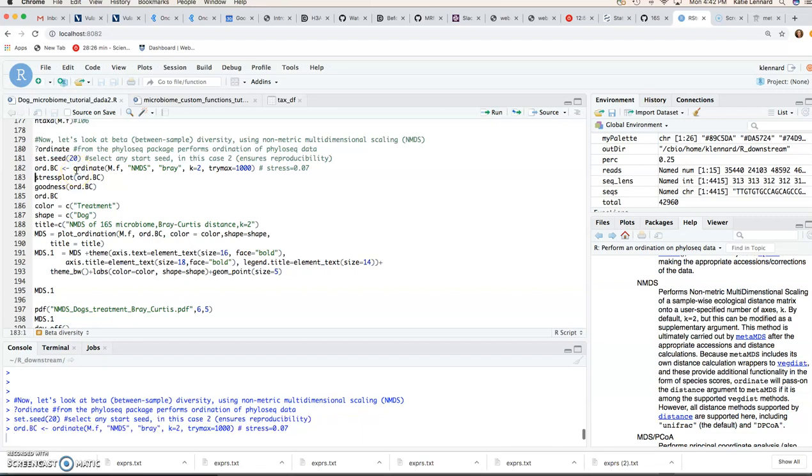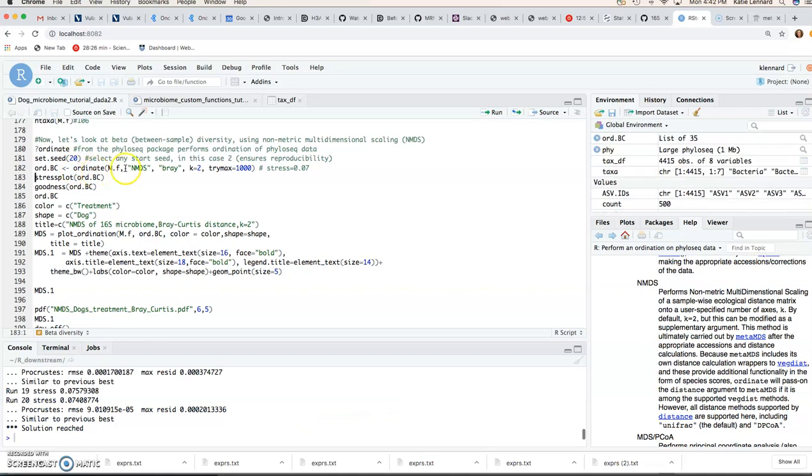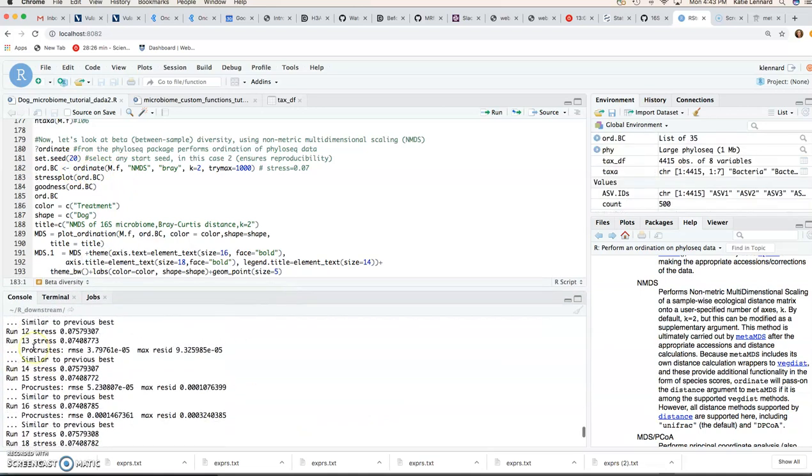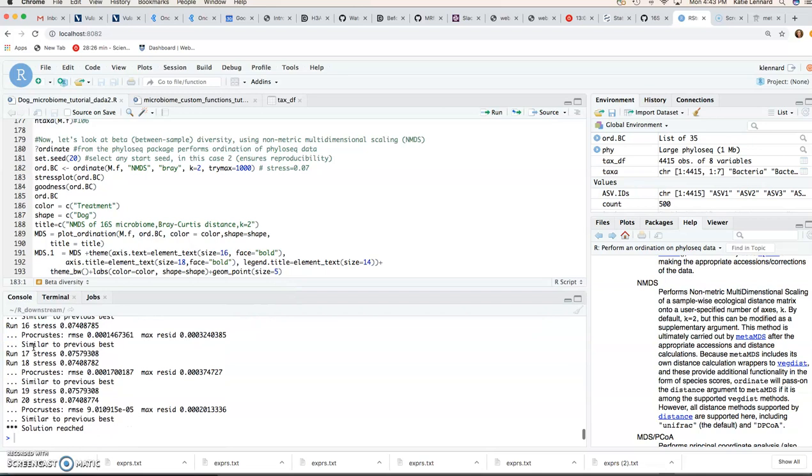Okay, then we do our ordination, and that ran quickly, and you'll see it runs through the iterations, and then it tells us solution reached.